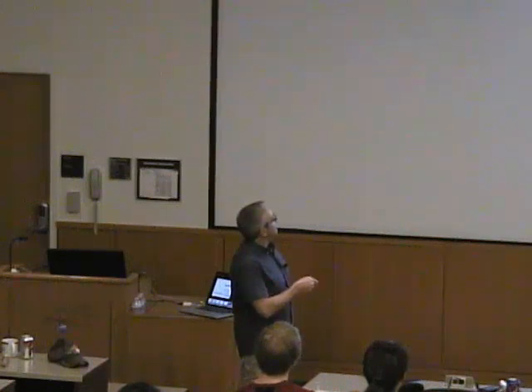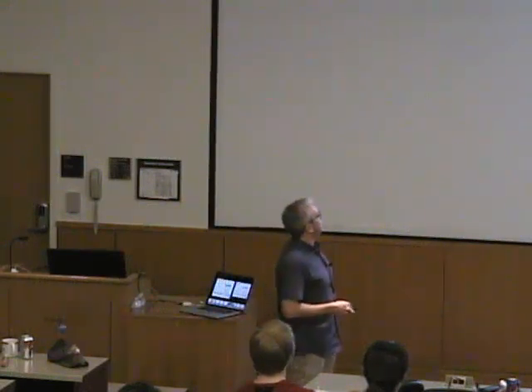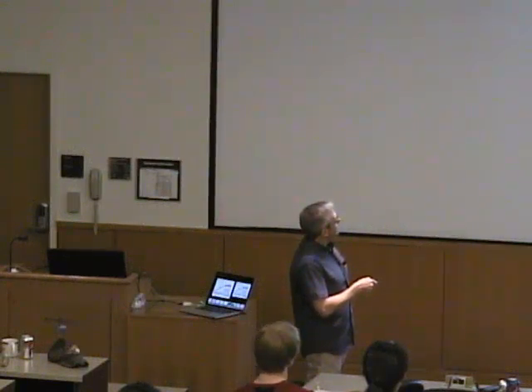Okay. Similarly, you could say this set of lattice planes cuts the A-axis in 2 and the B-axis in 1. So it's the set of lattice planes 2, 1. Miller indices H equals 2, K equals 1. That one, you probably get the picture. I don't ask you, but it cuts A in 2 parts, B in 3 parts. It's H equals 2, K equals 3. Okay? Now, nothing of this exists.